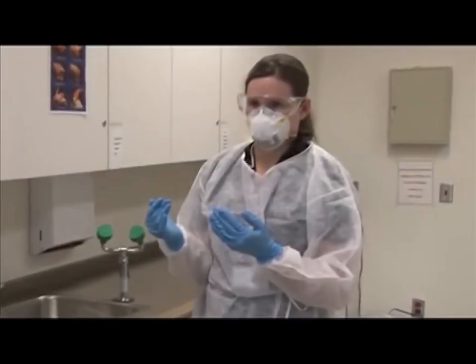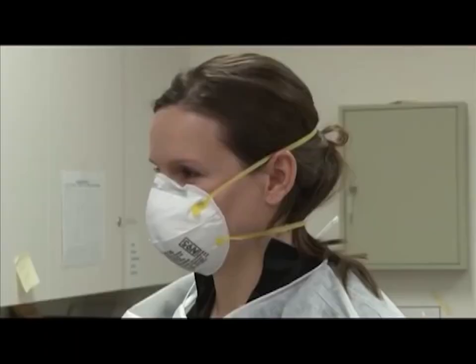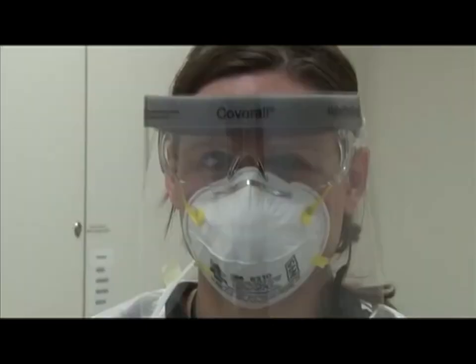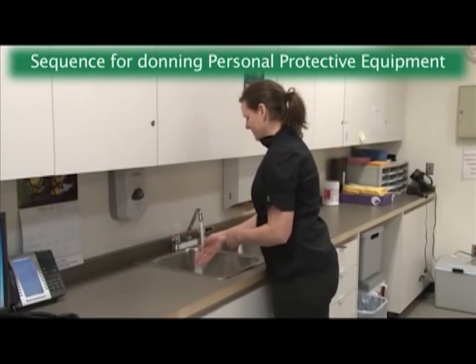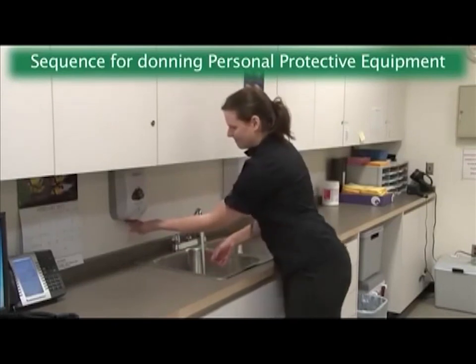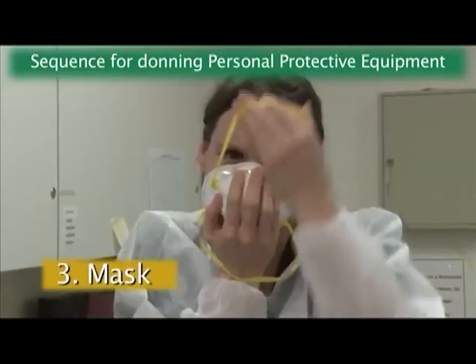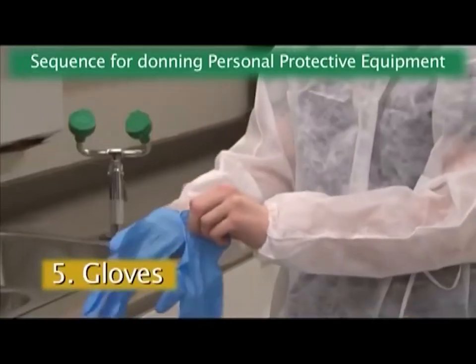Personal protective equipment is designed to protect against infections. Personal protective equipment acts as a barrier to prevent or limit contamination of skin, mucous membranes, or clothing of staff in order to prevent transmission of potential infectious agents. The sequence for donning personal protective equipment is designed to prevent and control transmission of microorganisms in the healthcare setting. The steps are: 1. Perform hand hygiene. 2. Gown. 3. Mask. 4. Eye protection. 5. Gloves.